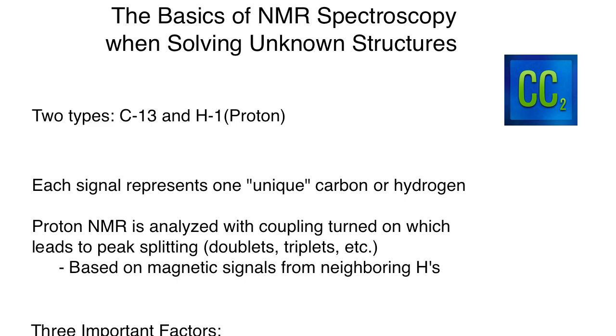So this is going to be more of an overview of all of those details so that you have a reminder going into the C13 lecture, which will be next, and then finally into the proton lecture when we do the H1 NMR, and then we'll tie it all together at the end as we practice, and we also get ready to sort of bring together a finalized, itemized list of what we want to tackle anytime we're attempting to solve an unknown. So let's get started with this overview here.